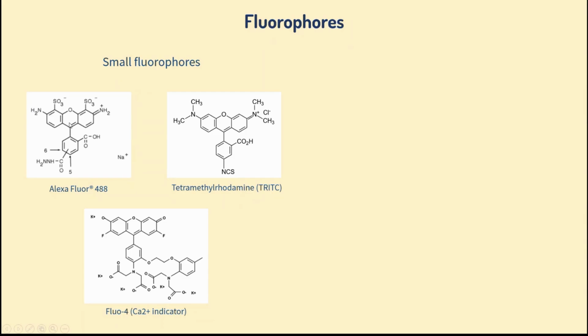A particular thing about all these molecules, and this will be useful for the next slide, is that these are organic structures, they have double bonds, and these double bonds are paired with single bonds. So all this structure makes a flat surface full of electrons above and full of electrons below.